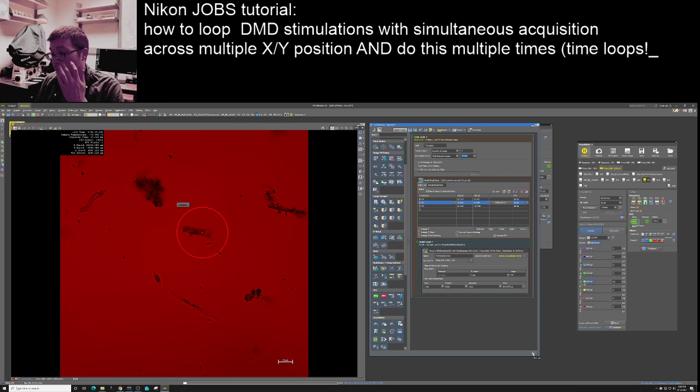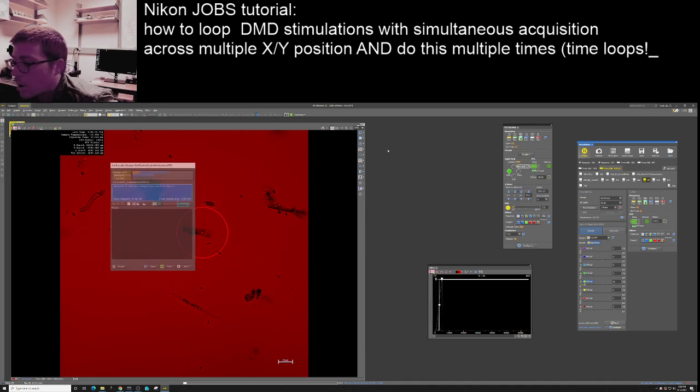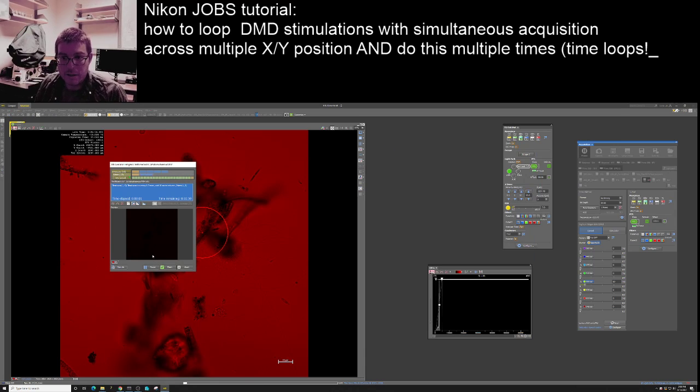And to run your job, you hit the play button. It'll ask you to give the job a name, and so we can call this test time and XY DMD simultaneous stim. Okay, so let's see.